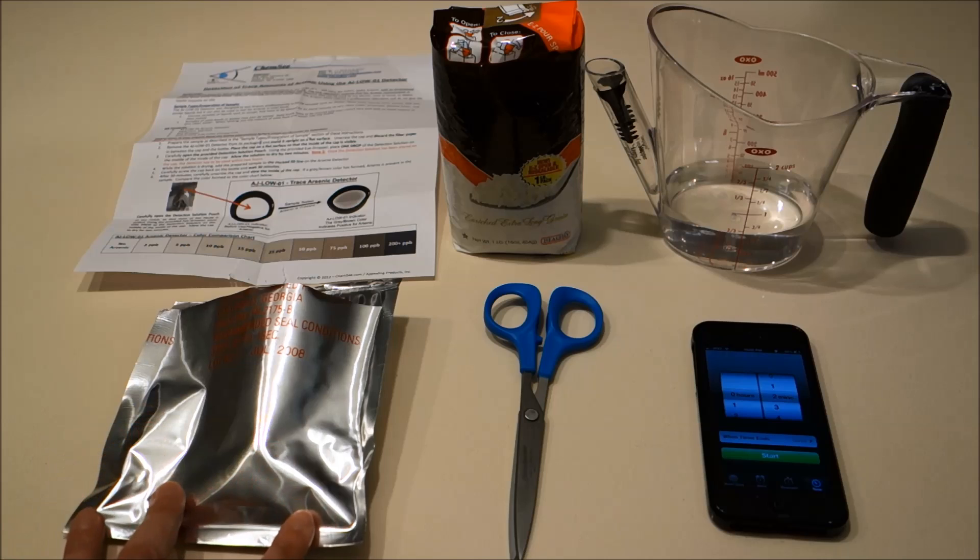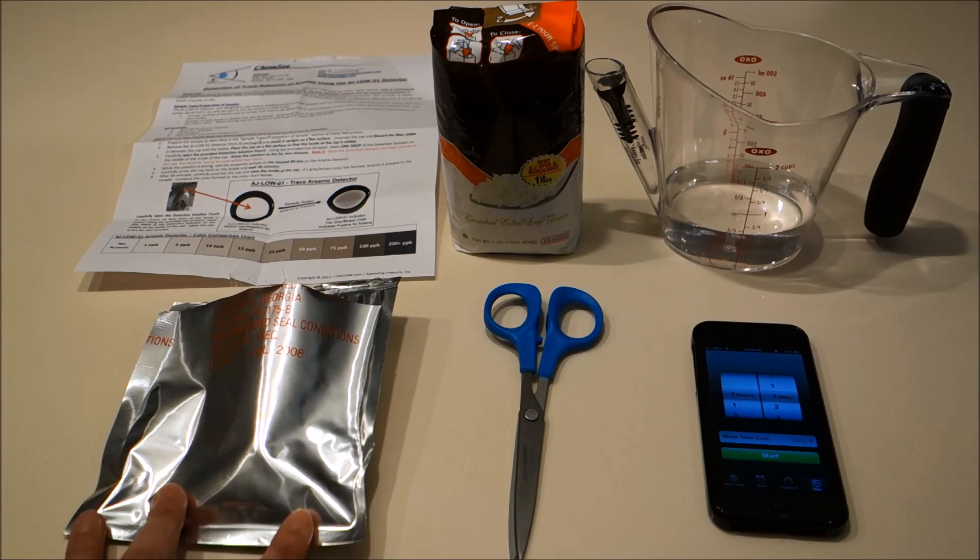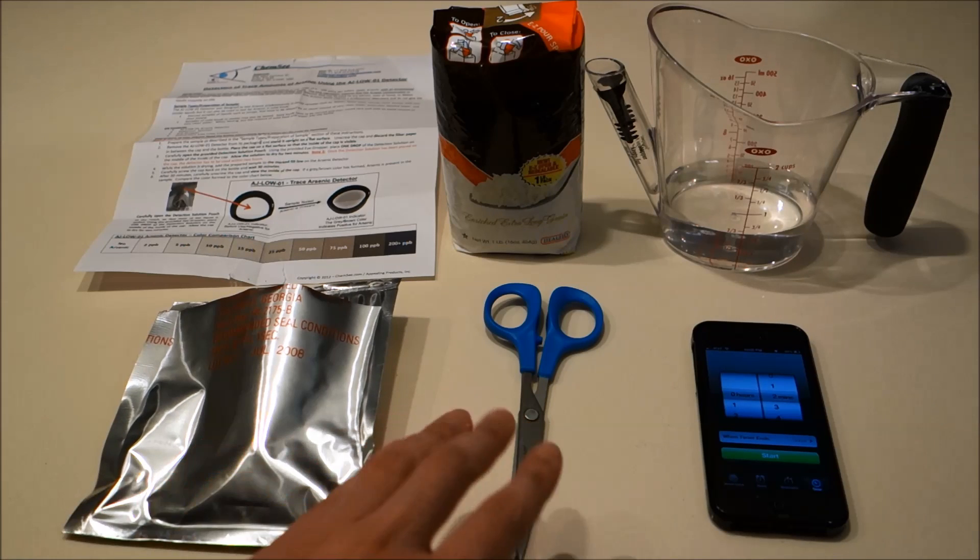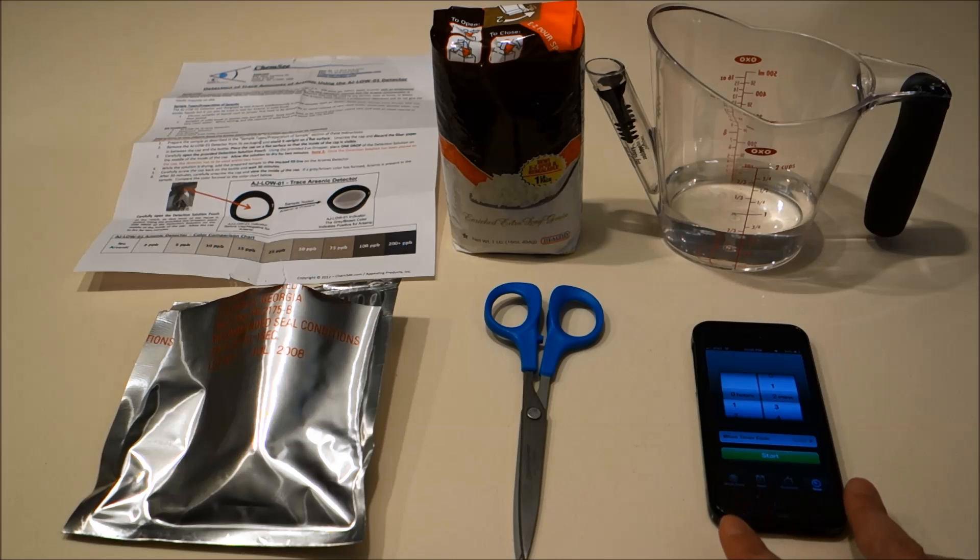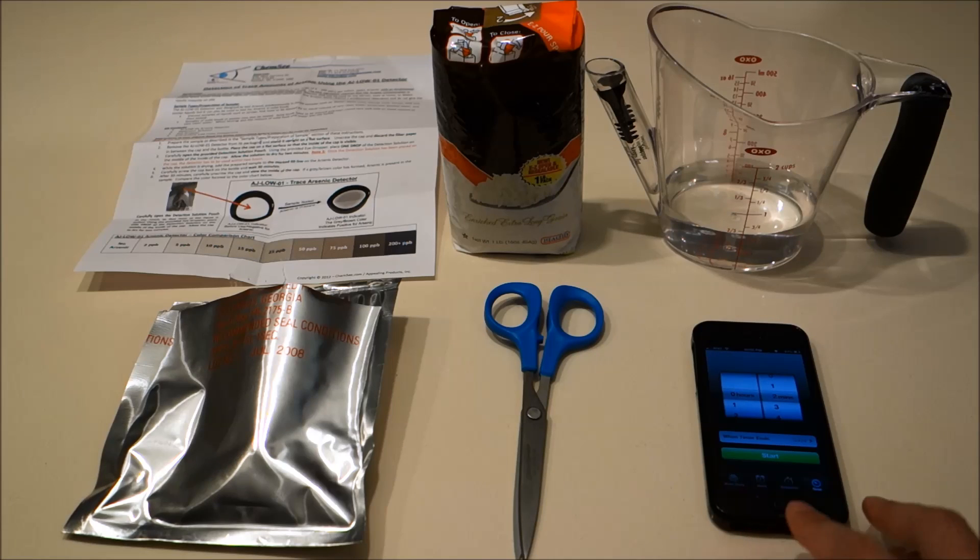You'll need the TestSafe arsenic detector kit shown here, a pair of scissors, a timer, in this case my iPhone.